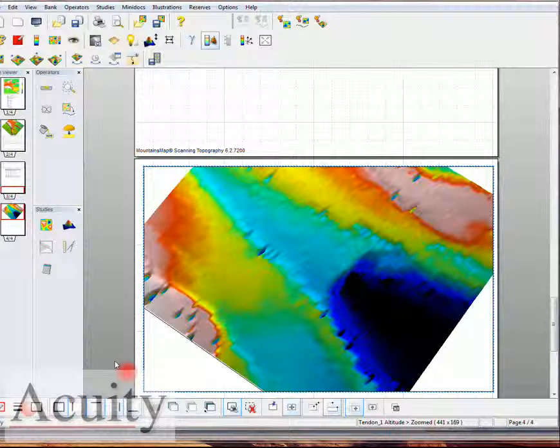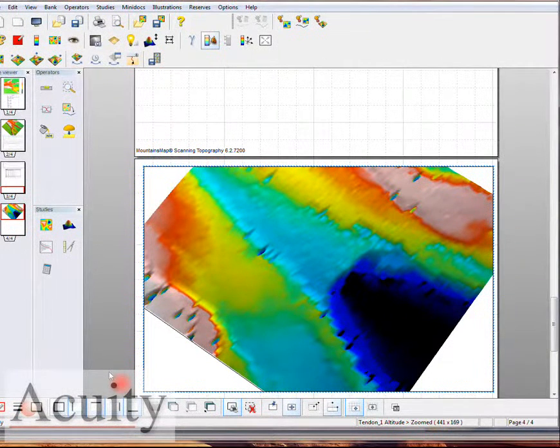So just in conclusion, a very good target, very good surface. We shouldn't have any difficulties in making this measurement.